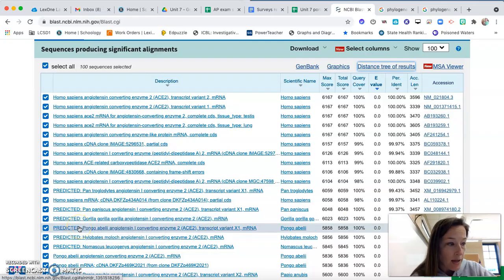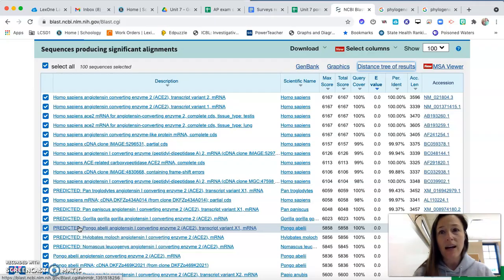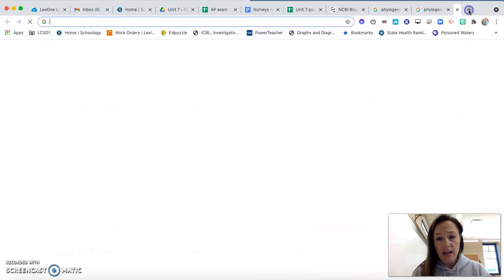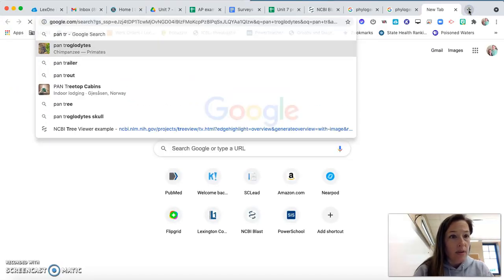And then we'll just do one more. I know in your lab you had to do 5, but we're going to be lazy and only do 4. And that is at 100% and 98.32.